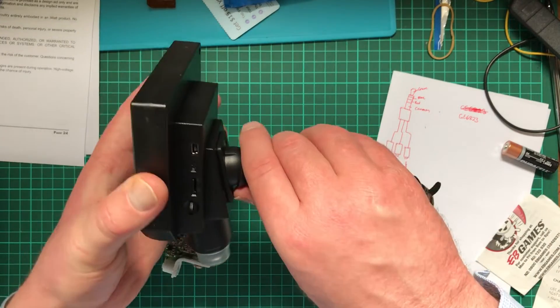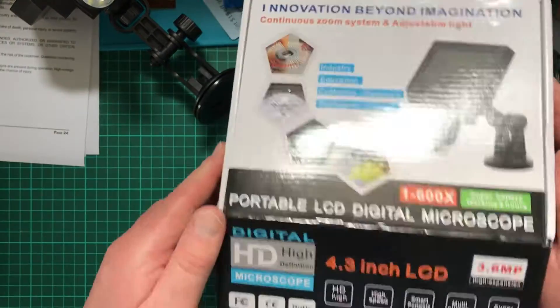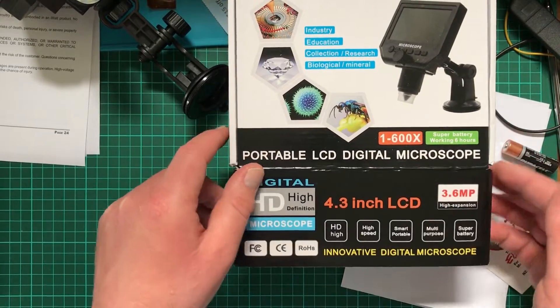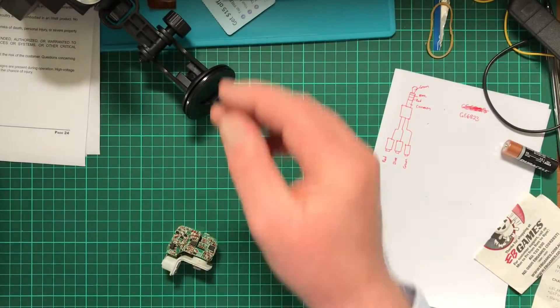Now I was thinking this would be able to record in 1080p, and if you take a look at the box, it states on here that it's 3.6 megapixels. But the camera itself fires up saying that it's 2 megapixels, and I can show you that.